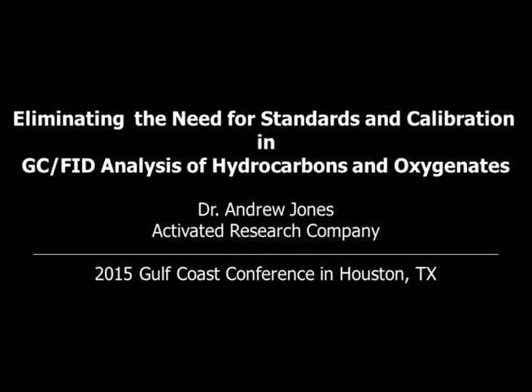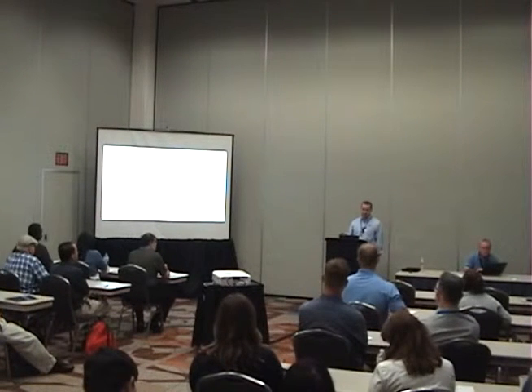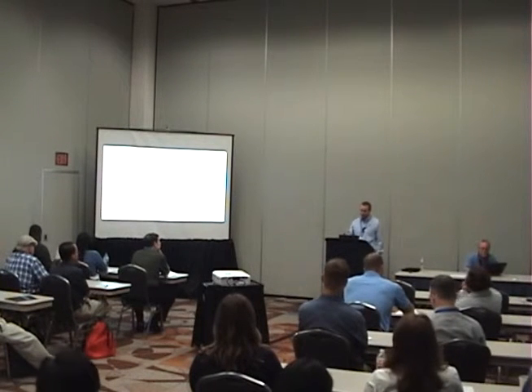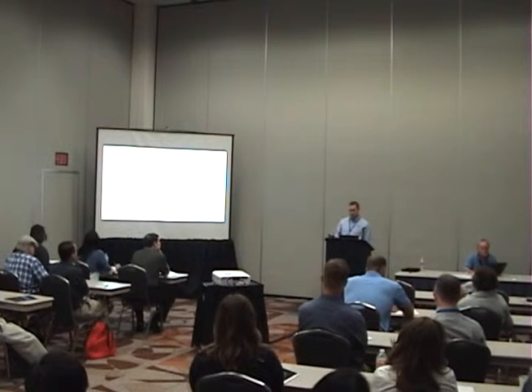So it has been almost 60 years since the advent of the flame ionization detector, or the FID. The FID holds the crown as the most widely used detector for gas chromatography because of its high accuracy, robustness, and its ease of use. But it has its limitations.